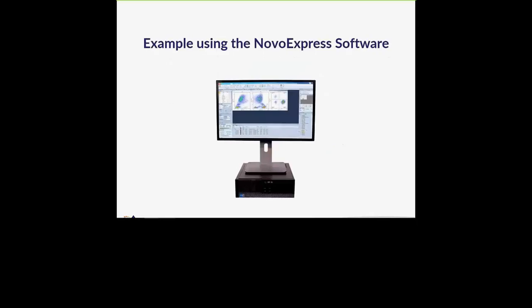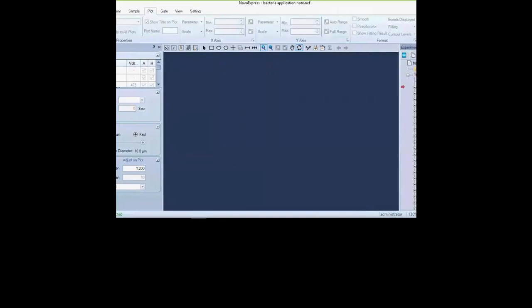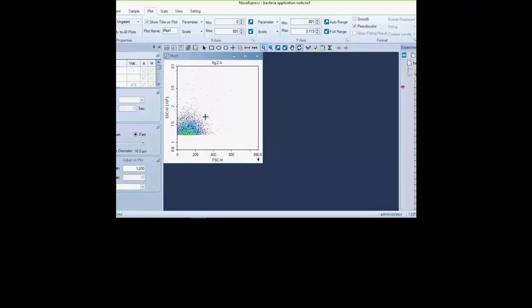Moving on to the same data example, here is how you can use the NovoExpress software that comes with the NovoCyte to analyze this data. When running your samples you always need controls. Starting with clean water as a blank, you begin with a forward scatter versus side scatter plot — forward scatter measures size and side scatter measures granularity. You can zoom into your area of interest using auto range or the magnifying tool. For a wetland sample, it can be quite difficult to tell which portion of the population is background noise and which is your actual bacterial sample.